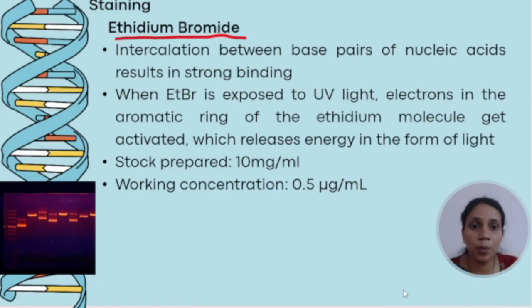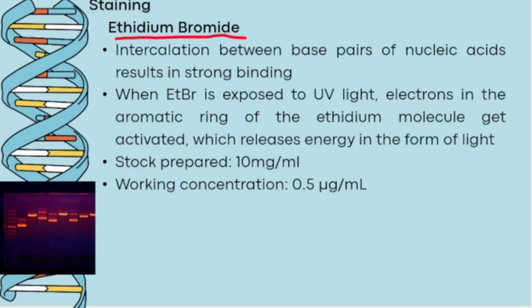So it is always advisable that we keep one dedicated, special flask or some glassware for the use of ethidium bromide. Because if we use it everywhere, it may get absorbed and it will affect the person who is handling it. For example, when you are working for a PhD, you are working for years there, right? You are getting exposed to it continuously. So it may affect you, which we may not understand initially, but at a later point of time, we will understand this.